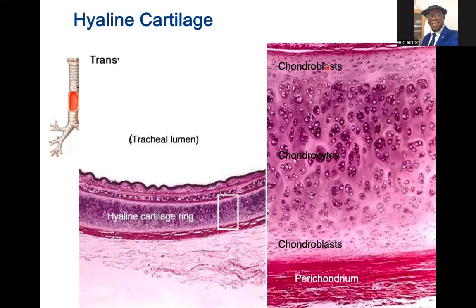So you have chondroblasts there, and then chondrocytes in the middle portion, or the medullary region. And that's another chondroblast layer, because this is a tube, right? So you find perichondrium on one side and then perichondrium on the other side. So you definitely have chondroblasts there, and then inside the middle portion will be chondrocytes.